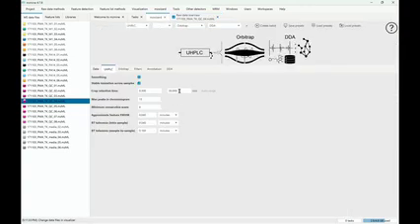I personally think, especially if you want to do statistics later on, it's sometimes better to not over-interpret the regions in your chromatogram that have very poor separation. So we can cut out the 8.3 minutes. The next parameters are actually not so important. Like the minimum consecutive scans is kind of important depending on what kind of mass spectrometry you do, right?